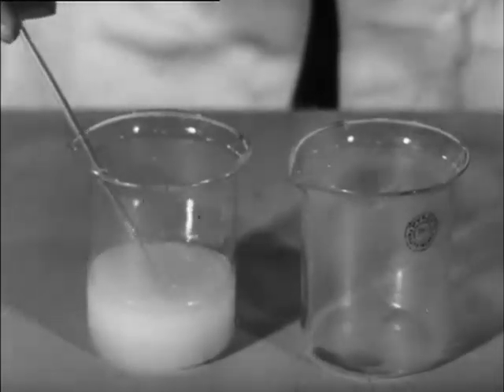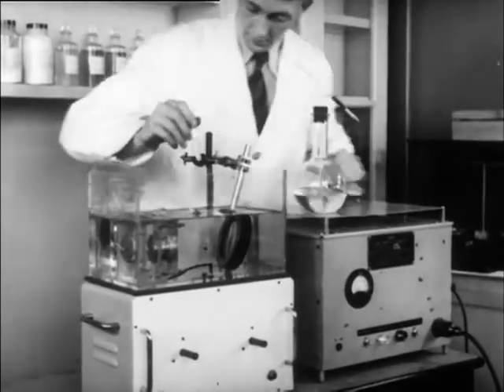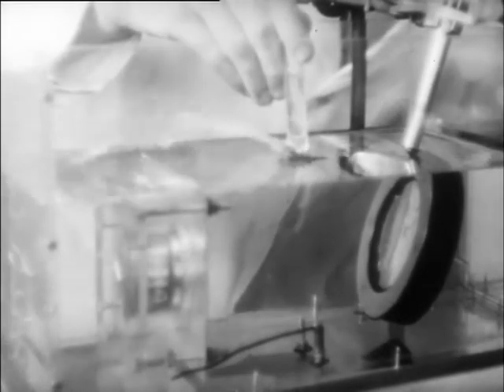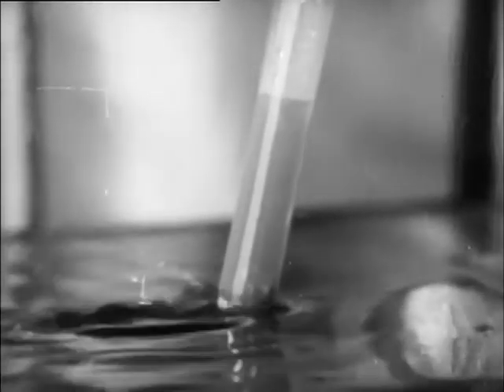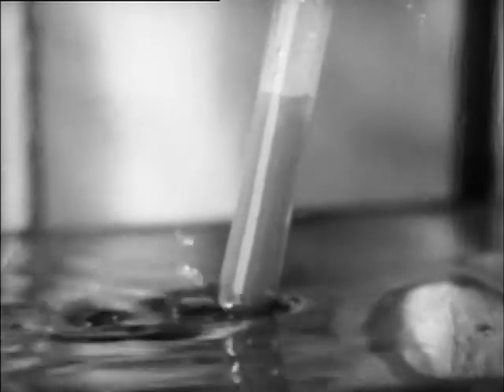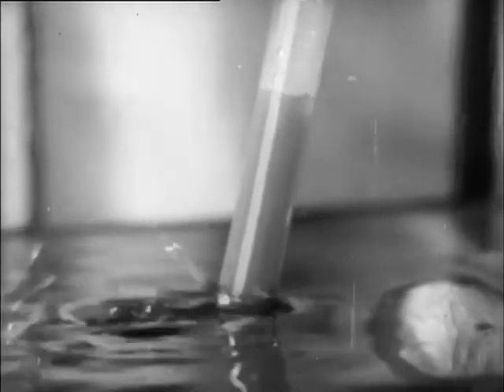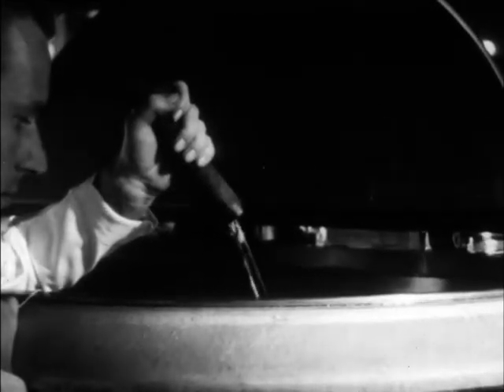In the laboratory, the liquids may be subjected to high speed, that is ultrasonic sound vibrations. Here we see an emulsion being made of mercury in water by this means. A tube containing the mercury in water is inserted in a bath of oil vibrating at high speed. These latter methods are of scientific rather than practical interest.